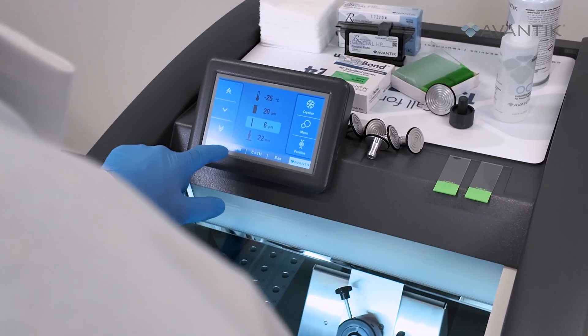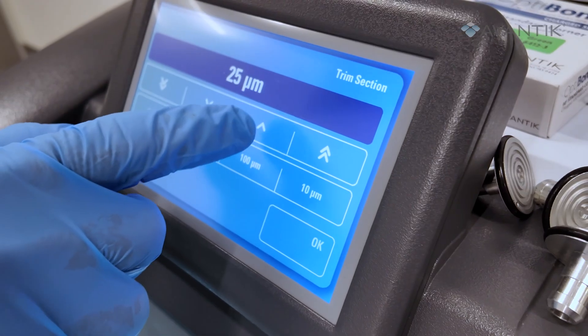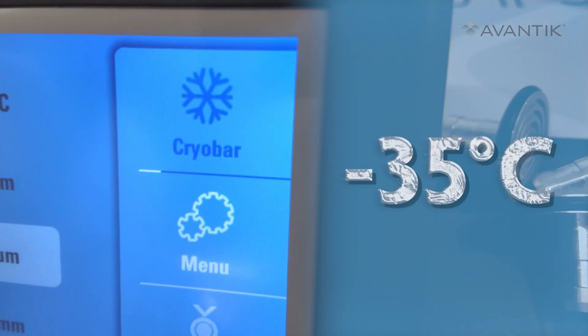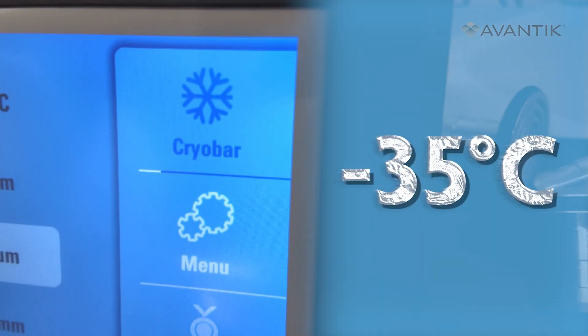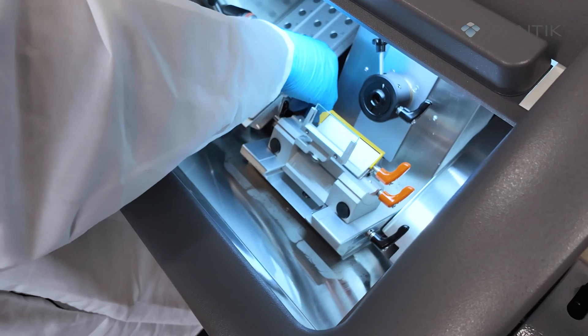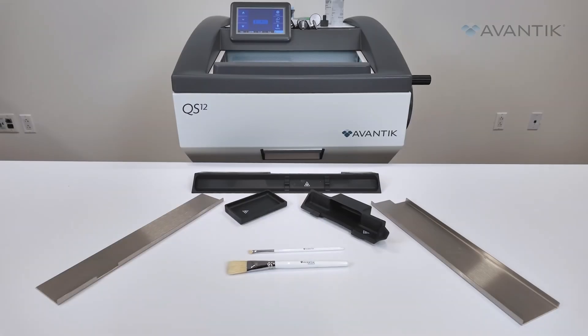The QS12 has a simple and intuitive touch screen. The adjustable settings allow for precise sectioning and temperature regulation to negative 35 degrees Celsius for a wide range of specimens. Plus, its smooth stainless steel chamber and removable parts make cleaning the QS12 quick and easy.